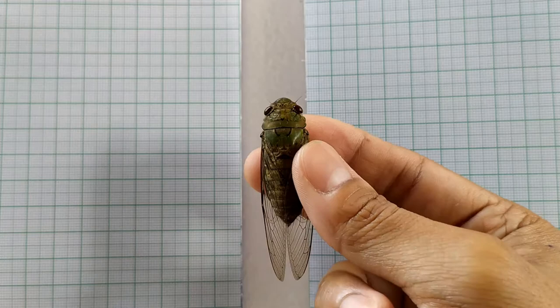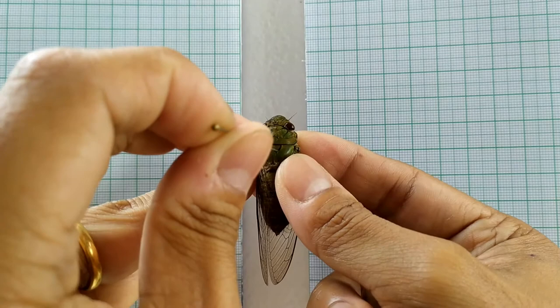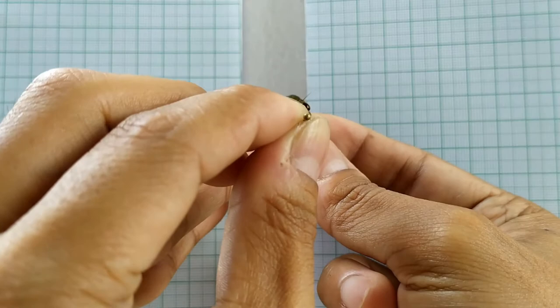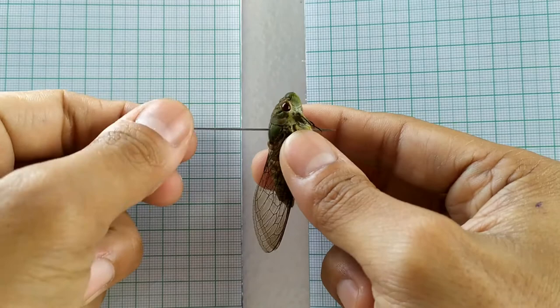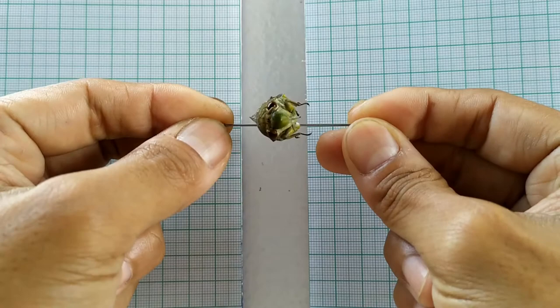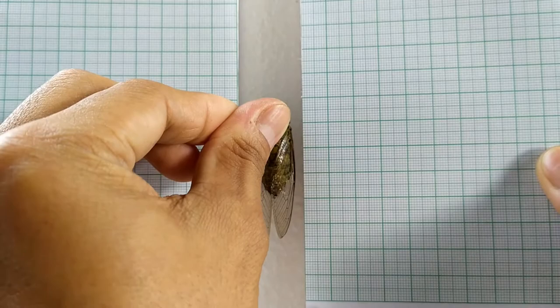To begin the pinning process, take the cicada specimen. Introduce a number five or number seven insect pin through the mesonotum area close to the longitudinal axis of the cicada body. Make sure that the pin is at right angles to the specimen plane at all sides. This requires a bit of patience and practice. Once the pin has been inserted correctly, position the specimen in the central groove of the pinning board such that the body of the specimen lies in the groove.